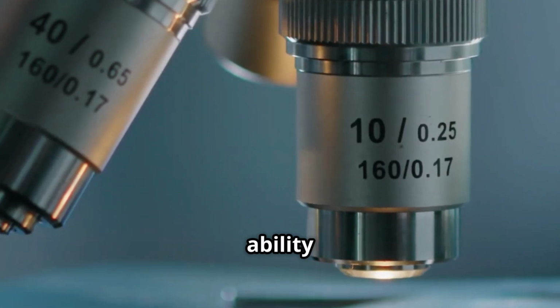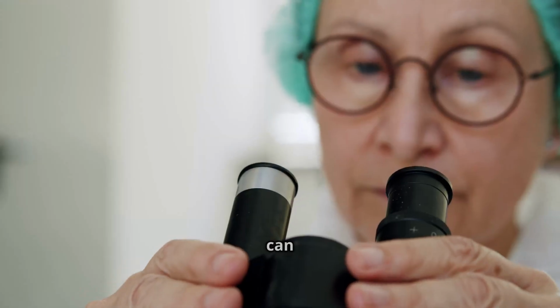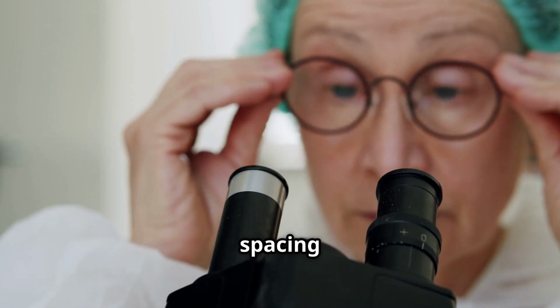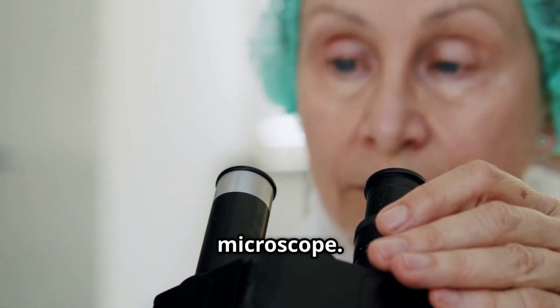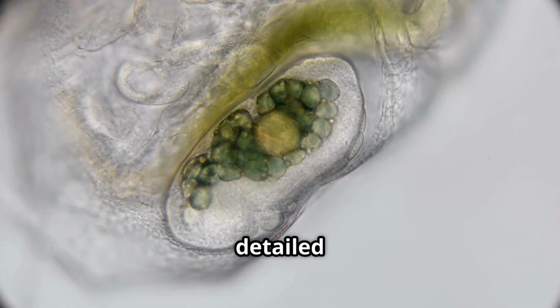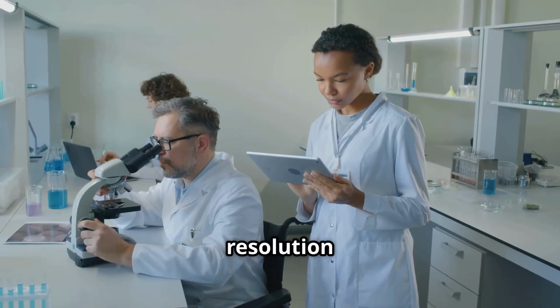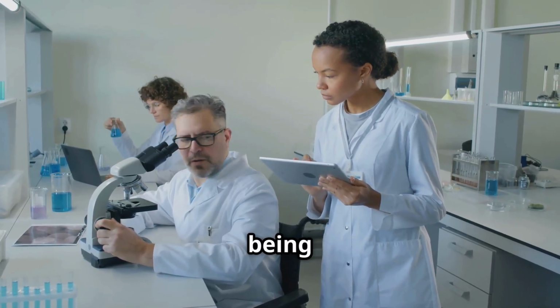Resolution: the ability of a microscope to distinguish two points as separate, or we can say it as the closest spacing of two lines that can be distinguished as separate entities by a microscope. Higher resolution provides a clearer, more detailed image. The resolution of any microscope is limited by the wavelength of the particle being used to illuminate it.